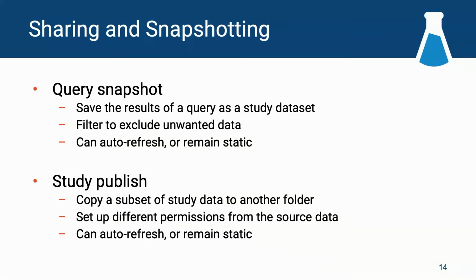You can set it to auto refresh, but from this workflow's perspective, you'd want it to remain static. So you're saying, I've got this, it looks good to me. I don't want any new data that's coming in to automatically show up in these other views, so I want to freeze that and put it off to the side. Maybe you want to manually refresh that, say, at the end of next month when you're ready to promote the next batch. But it's a way to have that snapshot frozen so it doesn't pick up anything new that you don't want to be there.